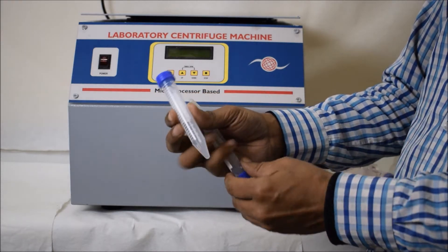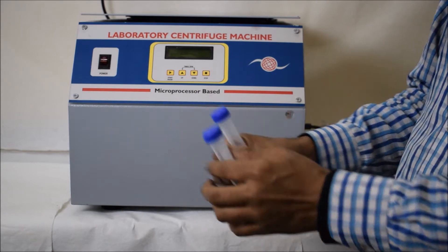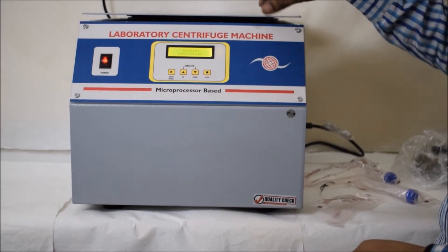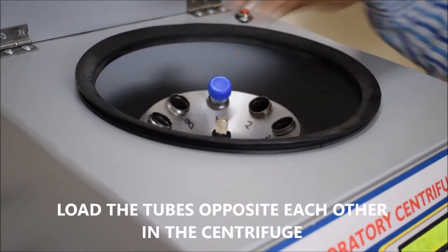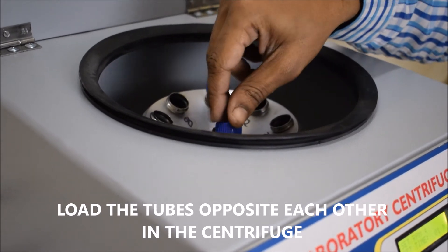The capacity of the machine is 15 ml tube and the number of tubes is 8. Always keep in mind that when you are using a centrifuge machine, its capacity and the tubes which you are using should be the same. Load the tubes opposite each other in the centrifuge.